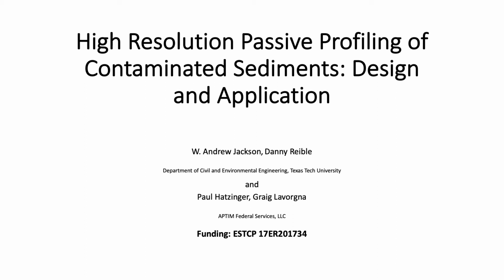Hi, I'm Andrew Jackson, and I am going to be narrating this presentation on high-resolution passive profiling of contaminated sediments, design and application. This presentation is mainly focused on describing the abilities and attributes of the high-resolution sampler, as well as a how-to of its application, how to install them, and how to sample them.